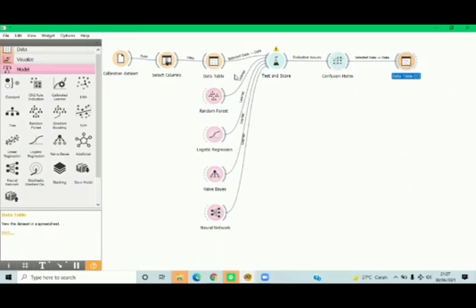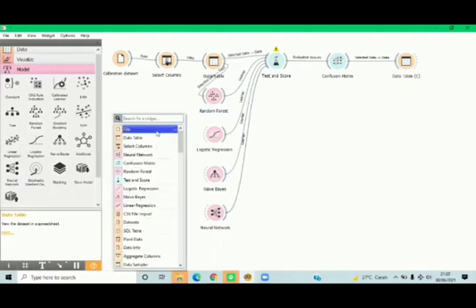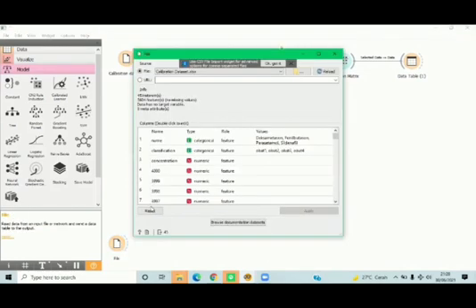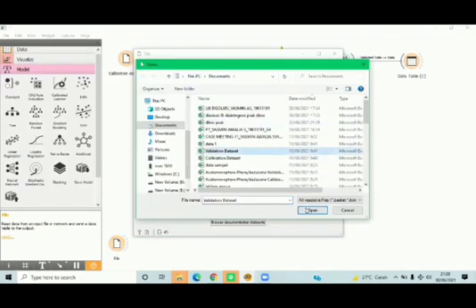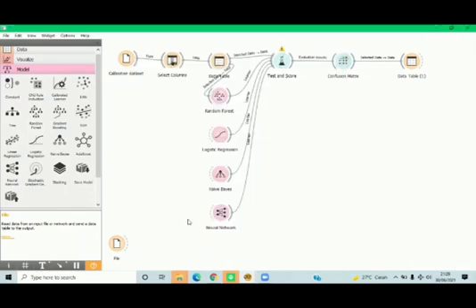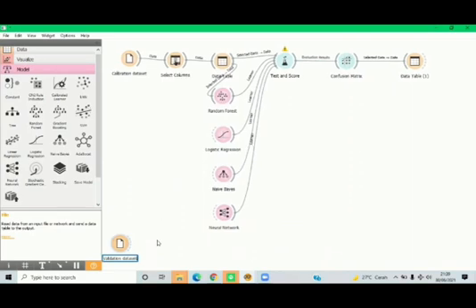After we analyze the calibration dataset, we analyze the validation dataset. First, we add the file, and then we select the file, which is the validation dataset, and then reload to make sure that the data we use is the validation dataset. Then please make sure that the name and the classification are categorical for the type. And then don't forget to rename the file to validation dataset.